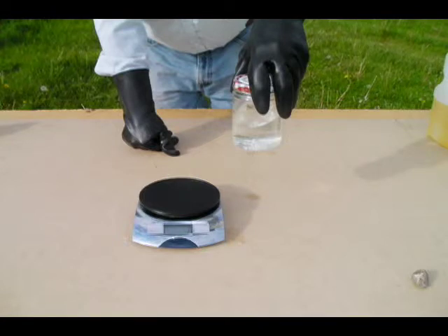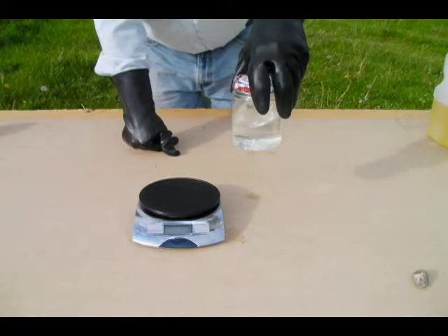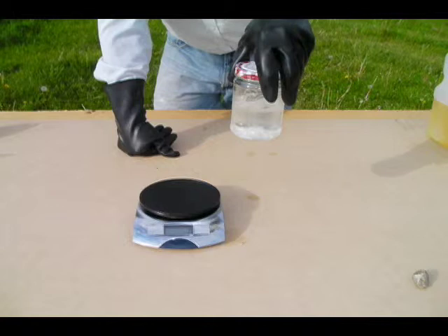Be very careful that your lid is screwed on tightly and completely free of leaks. It'll take a few minutes for the catalyst to dissolve completely, so be patient. The mixture creates heat as the chemical reaction takes place, and the jar will feel warm. This is a normal reaction.